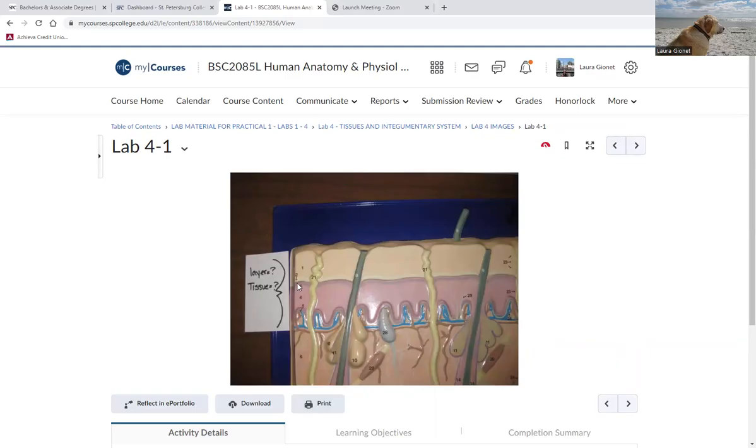But the pinkish region, from midway in your epidermis all the way down to the bottom of the pink layer where you see it undulating like waves, is called the stratum basale. That's your area of high mitotic division. And from the base of the dark pink all the way up to the top, that is your epidermis. And the tissue is stratified squamous epithelium.